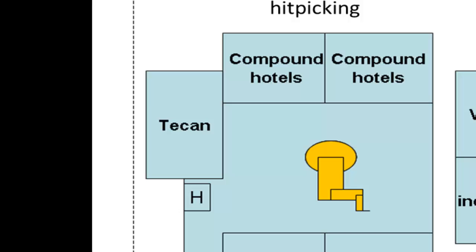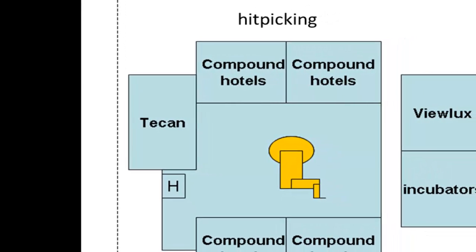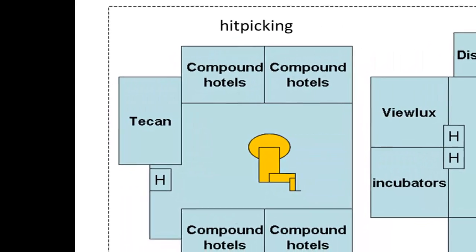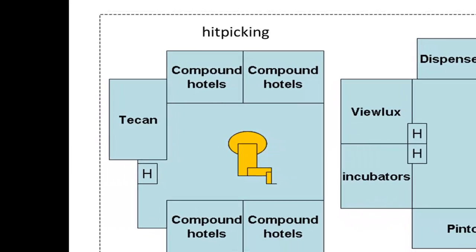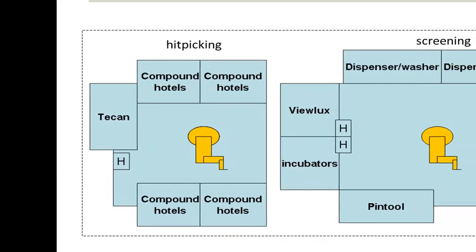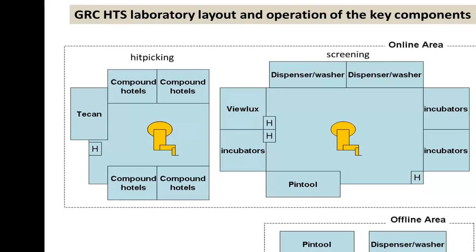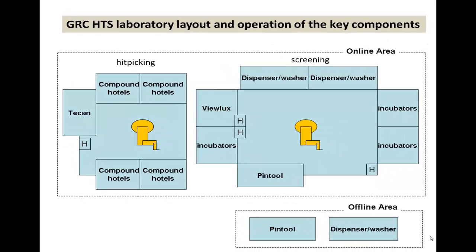This reorganized single plate of hits will be used to confirm the result we found in the high throughput screening, and the plate will also be diluted, so we can do a dose response curve to give a rank of the individual compounds in the activity of the assay that we conduct. So that basically completes all the assays in the high throughput screening procedures.